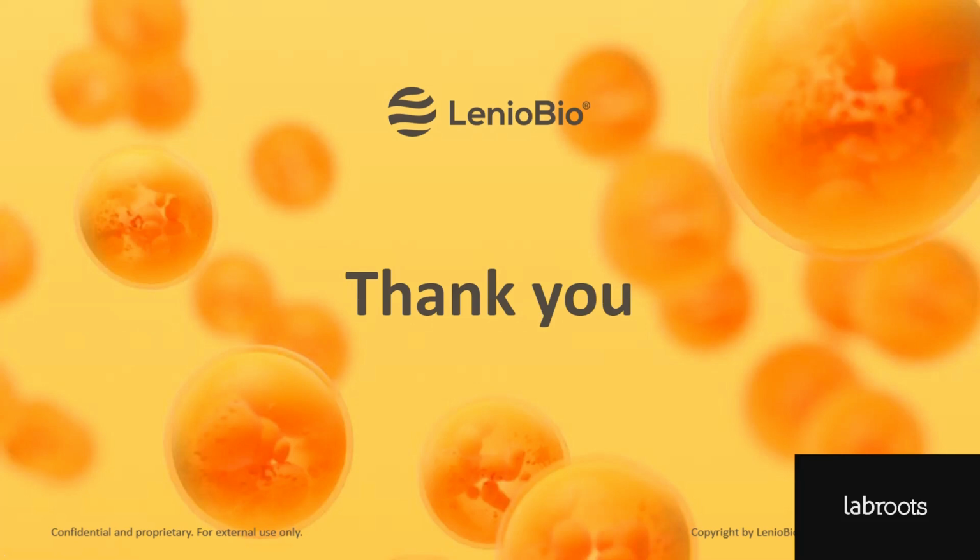It's quite a range of analyses required there, to be honest. So depending on the protein, really. A lot of these proteins, their function is intrinsically linked to these modifications. So, for example, in the case of the cannabinoid 2 receptor, a functional assay could prove the membrane insertion. But we didn't use, for example, microscopy at that stage. It could be possible to see the insertion.